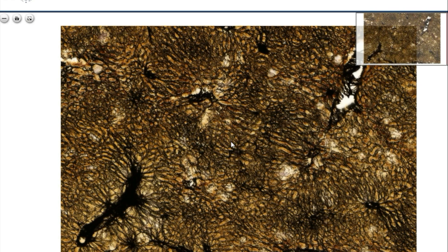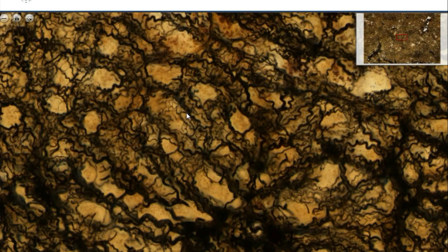Reticular fibers belong to the collagen type of fibers that are made out of collagen type 3. If we enlarge the picture, then you see the rich meshwork of coily reticular fibers around the liver cells.